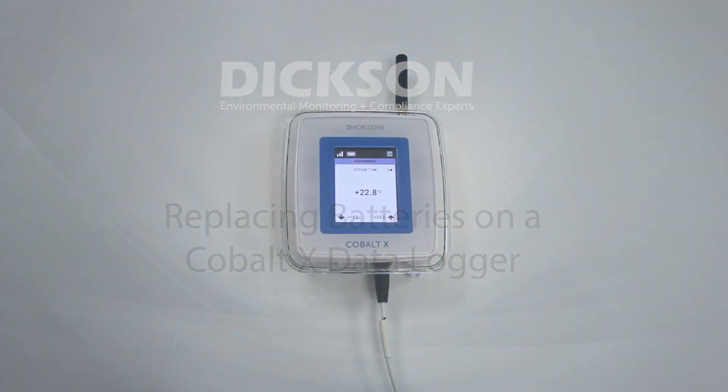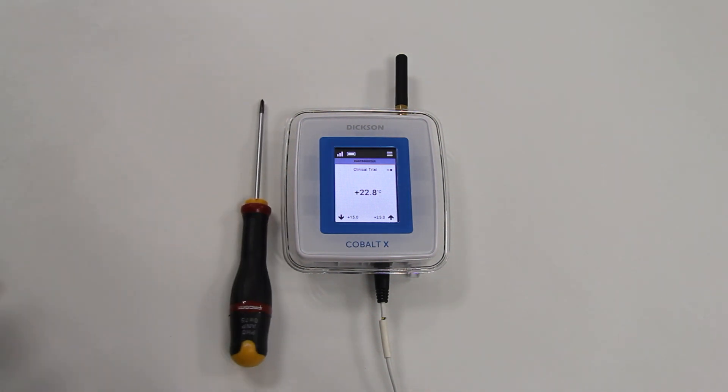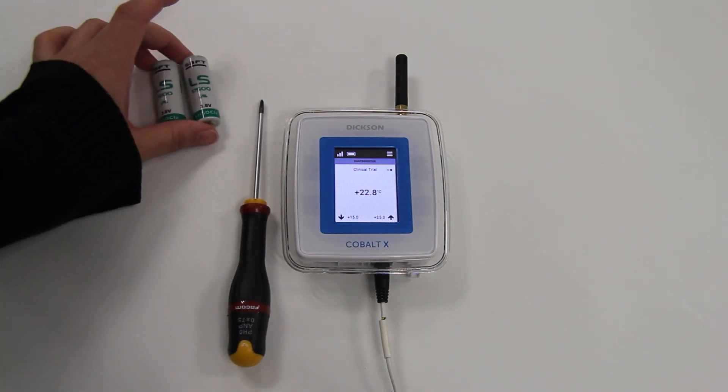Replacing the COBALT-X Data Logger battery is a simple process. The items needed for replacing the COBALT-X batteries are your COBALT-X Data Logger, a Phillips-head screwdriver, and two new replacement batteries.